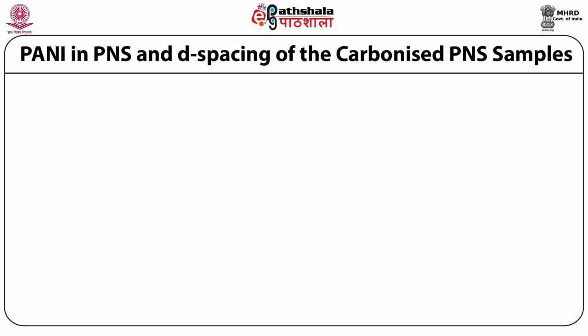Here is a case study where we will discuss the X-ray diffraction patterns of polyaniline nanosheets, abbreviated as PNS, and d-spacing of the carbonized PNS, that is polyaniline nanosheets. In this research, researchers took nanostructured polyaniline and carbonized it at different temperatures. So we will see the corresponding effects on the X-ray diffraction.